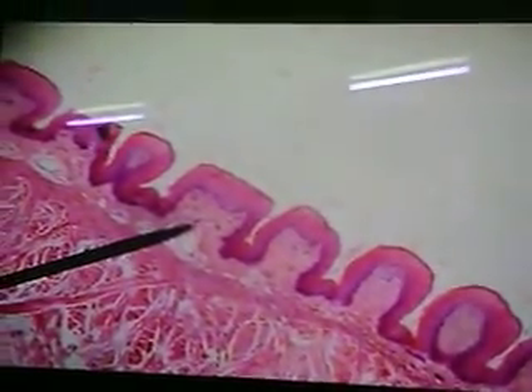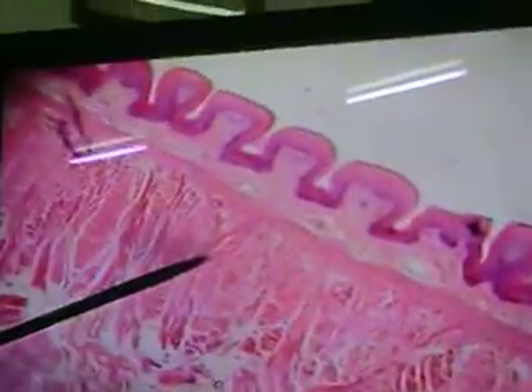So there we see another good example — fungiform papillae, right here. Not one taste bud visible in it.